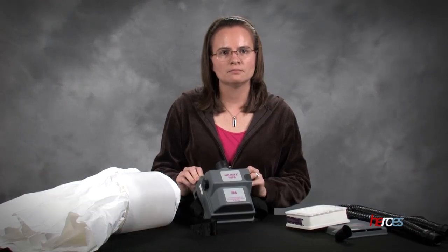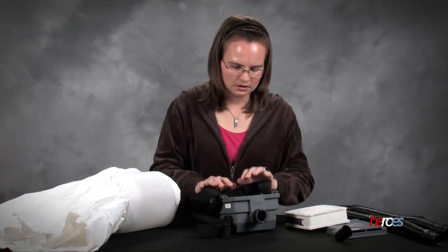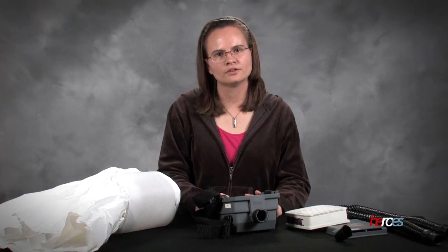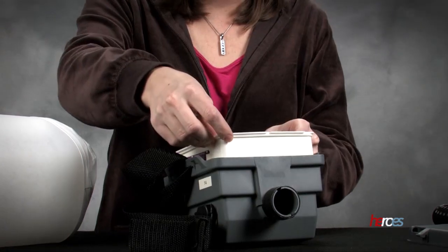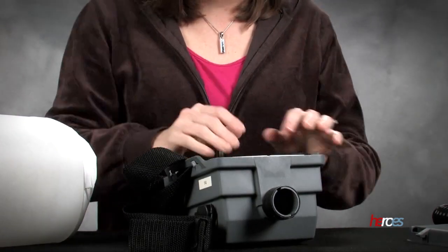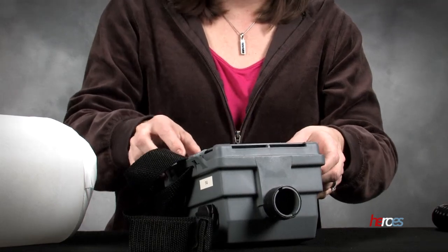Hello, my name is Beth Beam and I'm going to demonstrate for you today the 3M AirMate PAPR. The PAPR from 3M is a little bit different than some in the fact that the filter actually sits inside the device and then the back panel actually snaps on to the back of it.